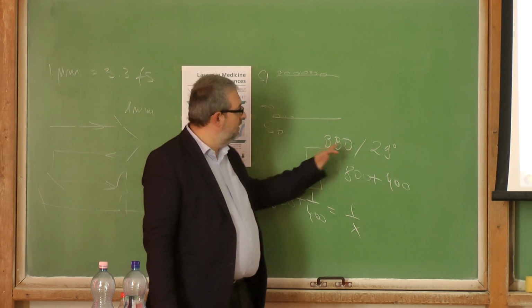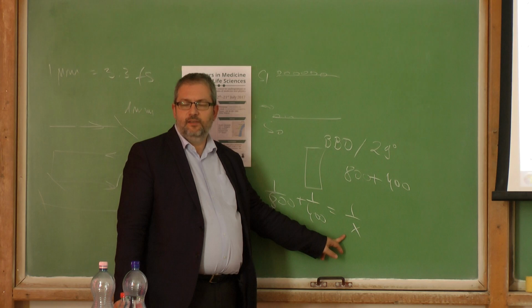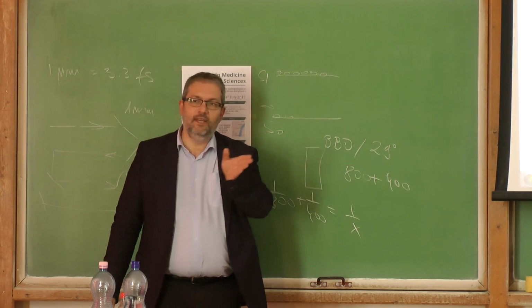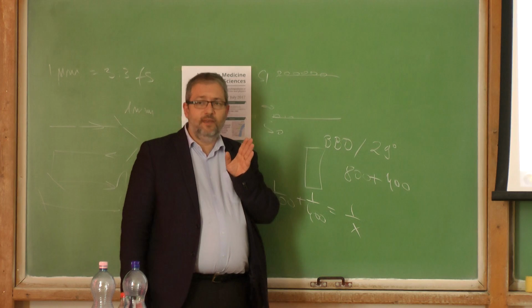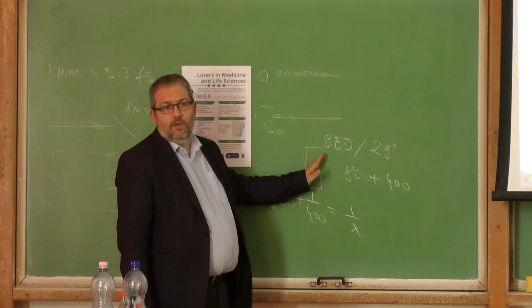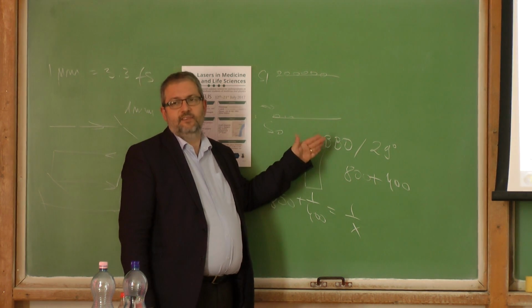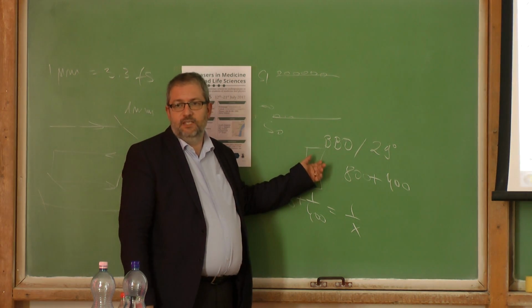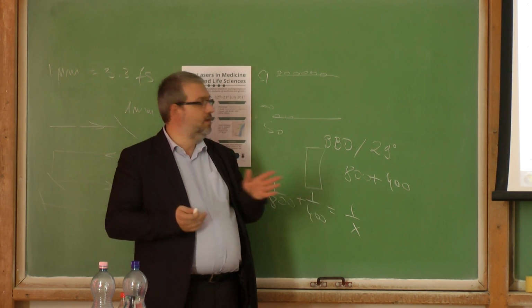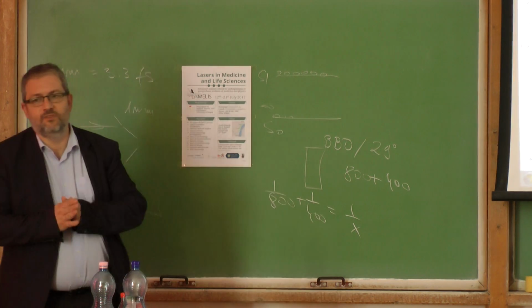But it is generated only at a certain angle. If you set your crystal at this angle, you can measure only, let's say, photons at 360 nanometers, and you can see the decay as you change the delay stage. If you want to measure the fluorescence decay at, let's say, 450, you have to rotate your BBO until the phase matching criteria are fulfilled. So that's why this is a slow process. It can be done, of course, we did it, you just won't have a whole spectrum from the very beginning. You have to make this spectrum one by one, 360, 370, 390, whatever. So this is not a nice thing. We did it also, but it's time consuming, of course.